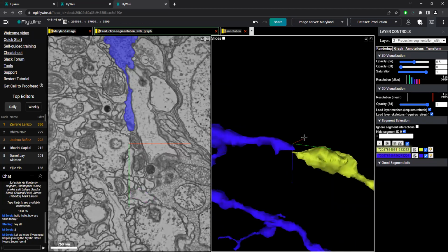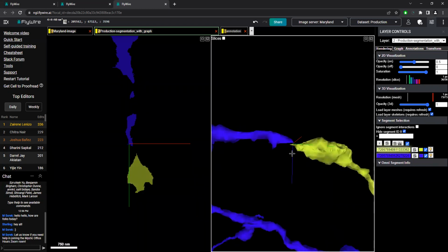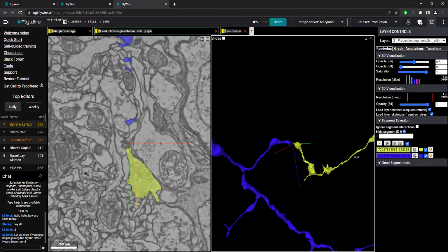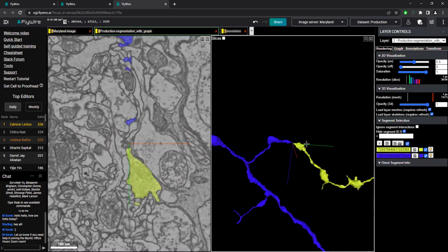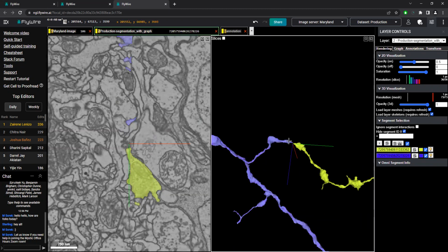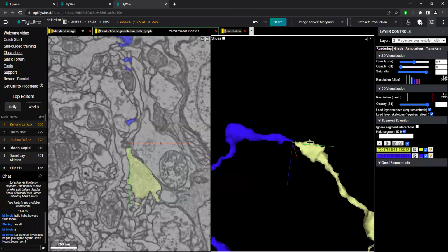So it's a little bit of trial and error, but it seems to flow very well. And the fact that it fits with the rest of the cell tells me that that's definitely where your continuation is on this. Notice I didn't use any annotations really for this. I mostly just used it by coloring the segments different colors, whether or not I decided that it could be a possibility that it belongs, or that it couldn't be a possibility that it belongs.